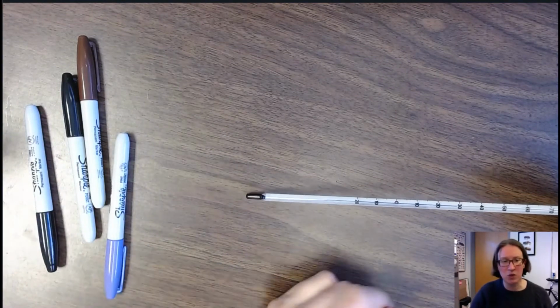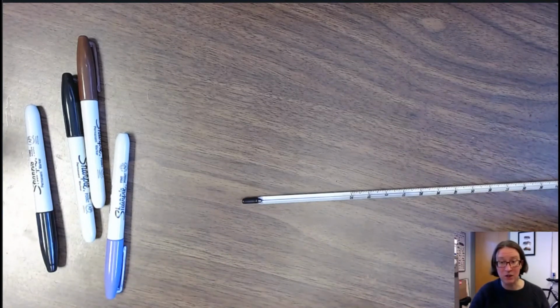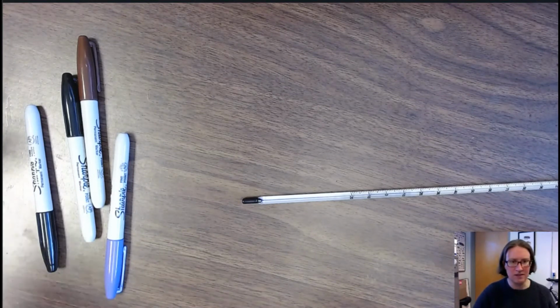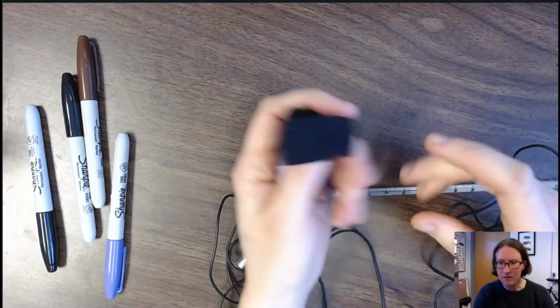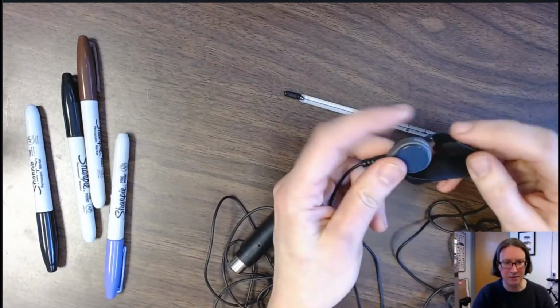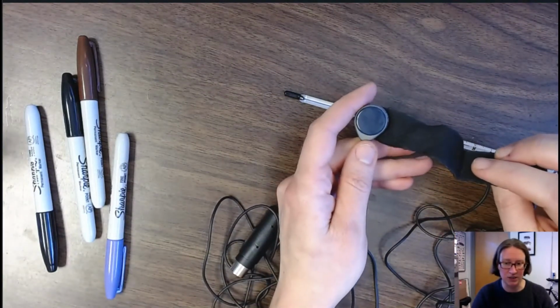And temperature is one thing that can be sensed, but you can sense a lot of different types of things. So it's possible to sense light, electricity, force, or pressure. And so this finger pulse transducer that I have right here is a device that is configured to detect pressure, or more specifically, a change in pressure.